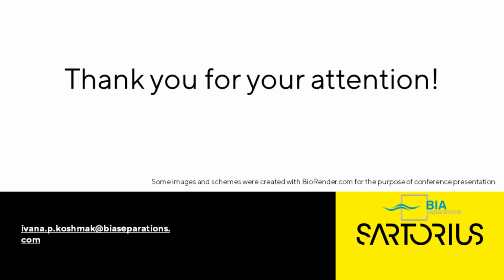Okay, great. Thanks, Ivana. So, how much time does it take to analyze one sample? So the full analytics of a single sample from the moment the sample is prepared takes about 1 hour. This is not to say that you have to be present all of the time during that analytics. It is sufficient that you prepare samples, you leave them on the autosampler tray, and you can control the machine and the analytics also from your computer, from the office, or from home.